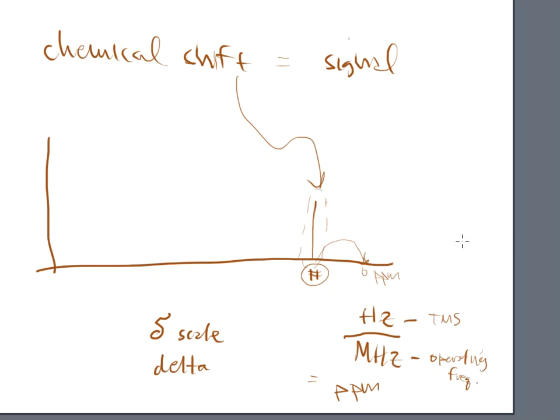Okay. The numbers that we see typically down here on the bottom, 0 normally starts over here on the right-hand side, and we normally go to 12. It can go a little bit further than that, but on a normal working NMR that we will interpret from here on out, that's just the normal working range for analysts who might take a look at this type of data. It really just stops at 12. Keep in mind it can go further, but 0 to 12 is the typical working axis on the x-axis of the NMR spectra.